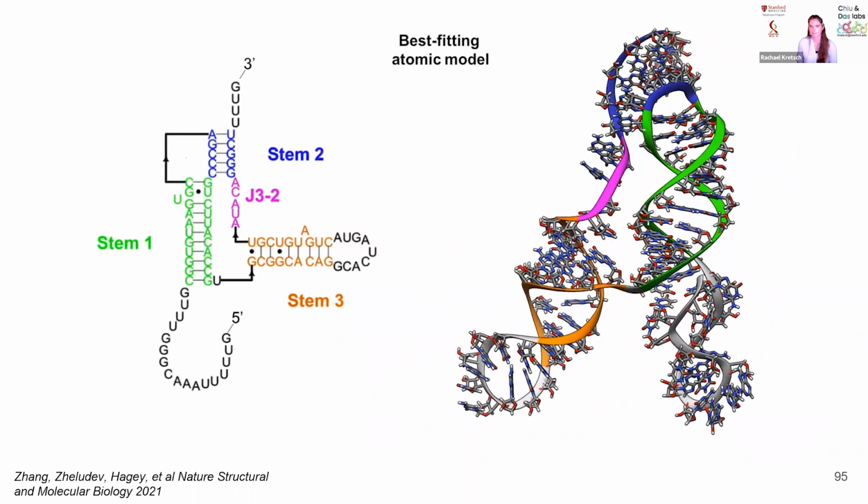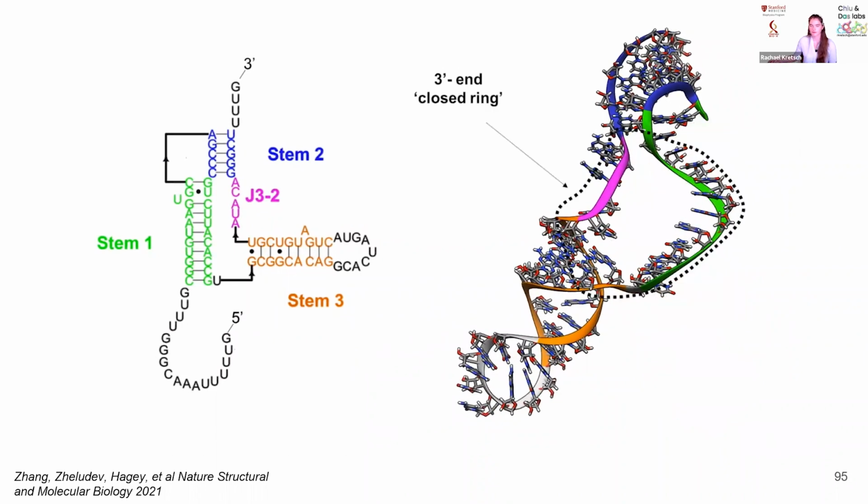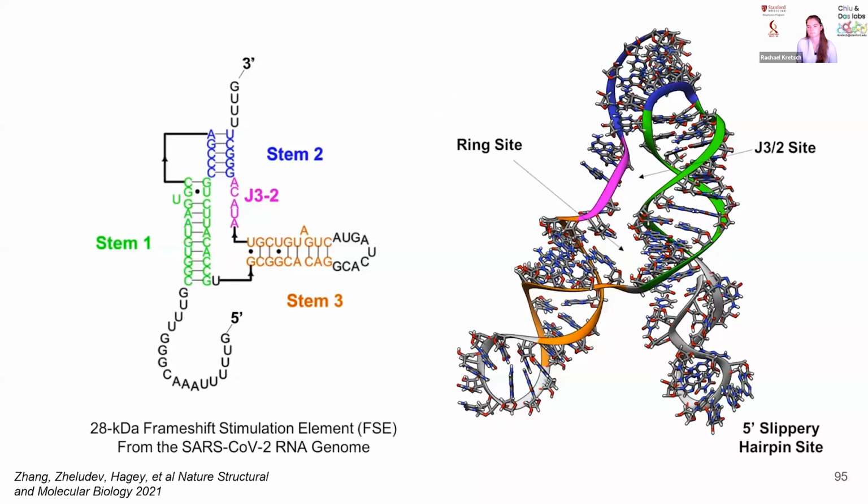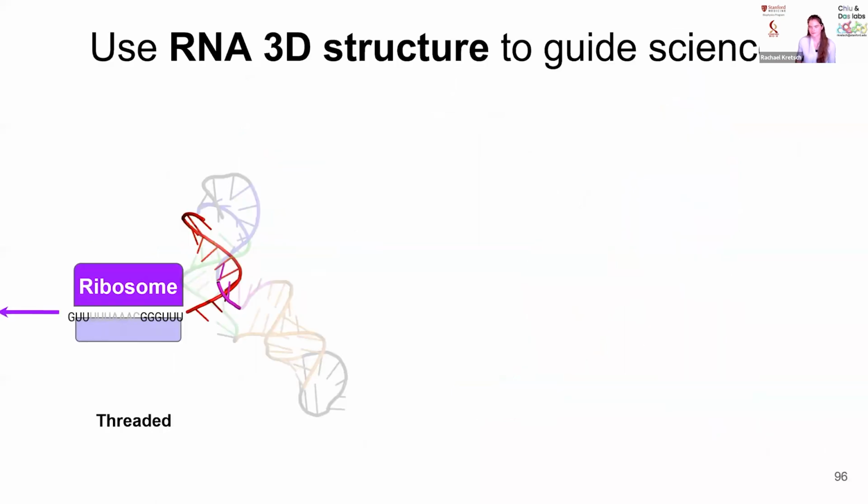Just one more time, we remove it. Now we can see where it goes. It's going to thread directly through the pink and the green. Okay, great. It's threaded through the pink and the green strings.